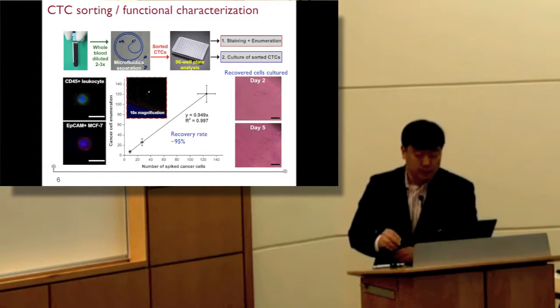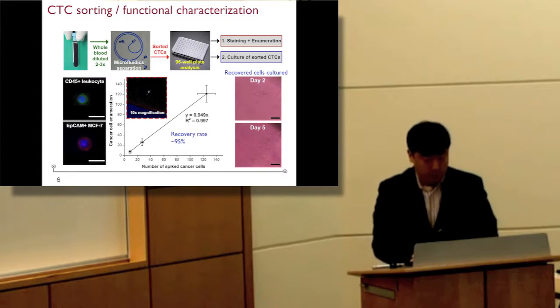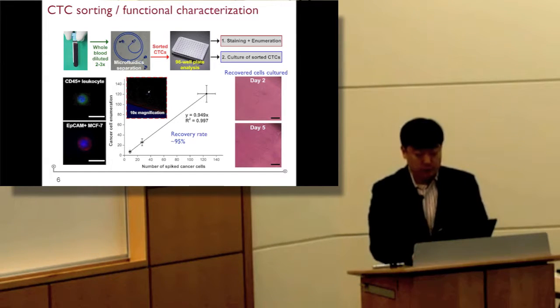Showing some of the early results from our group, we applied this for collecting the CTCs from patient blood, and the workflow is very simple. You take the whole blood, you dilute it probably twice, and push it into this simple microchannel, and we collect the cells contained in a large volume of solution, and we can do whatever we want to do.